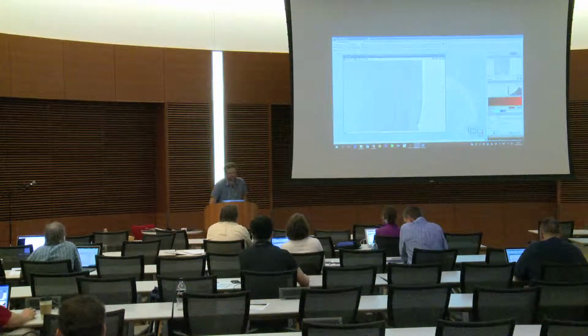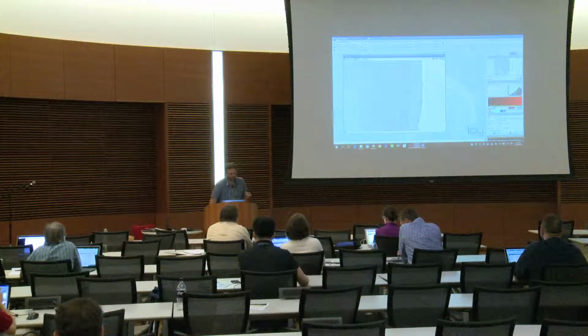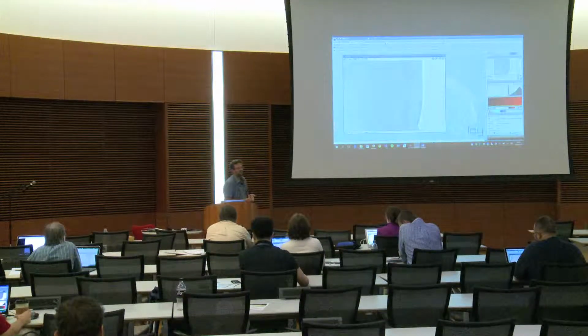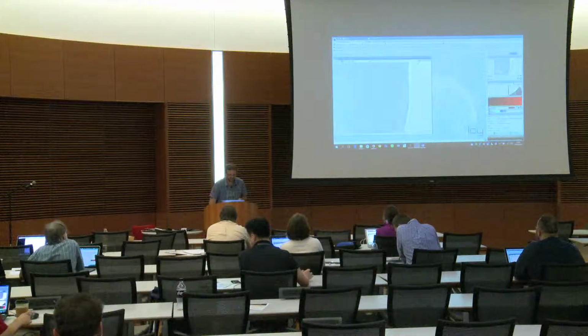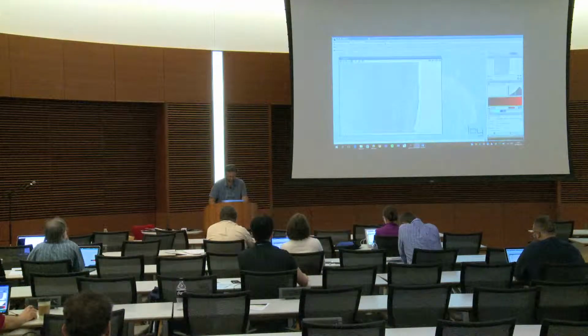You have the crop, the canvas size, the image size. For the channel, you can extract a channel here. You can remove, merge. You can do whatever you want. But there is a more natural way of doing things, and that is to type them in the search bar. So let's say, for instance, in this image, what I would like to do is to extract the channel.